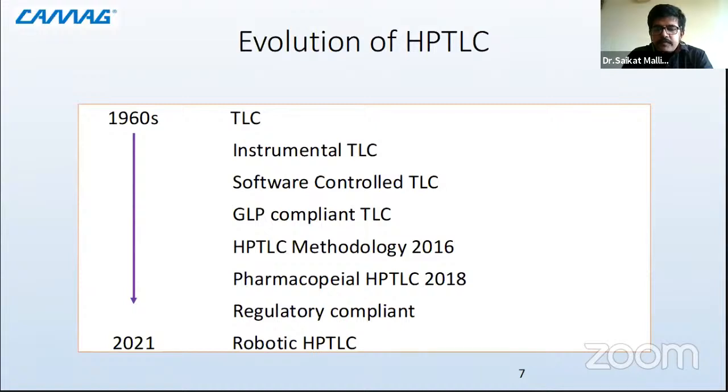Then when we move on to the development of thin layer chromatography, this technique had a lot of advantages, because of which a few companies started instrumentalizing the process of the entire separation. The instrumentation was introduced to give a better outcome, to document the results, and to get a lot of data from the simple format of TLC.